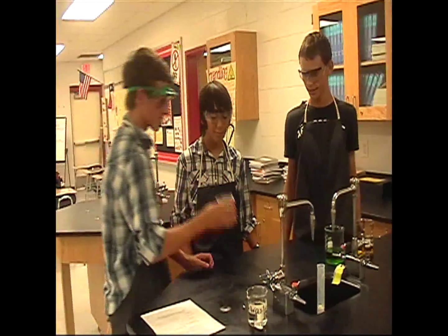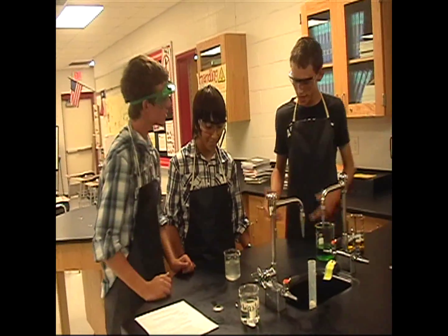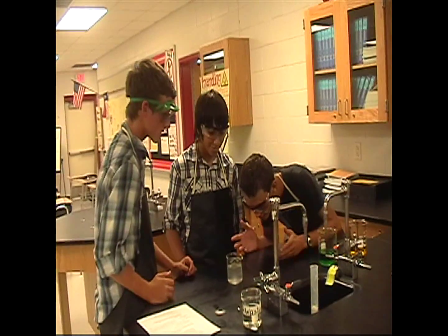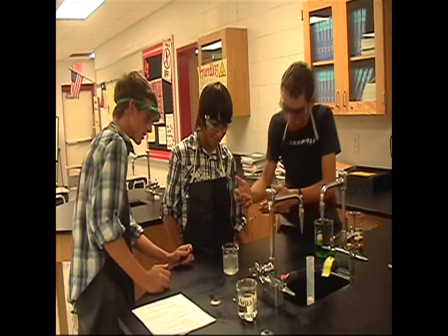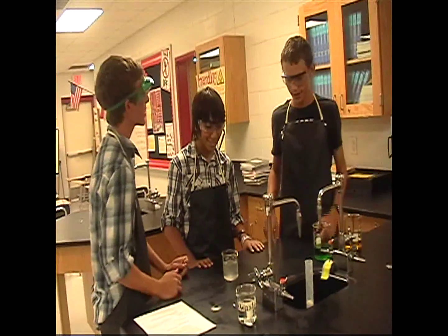One character brings a chemical, but the other warns: 'Dude, that's way too much.' 'Are you sure?' 'Yeah, I'm positive — you're only supposed to get a hundred milliliters, and you got a hundred fifty.' They consider just putting it back where they got it.